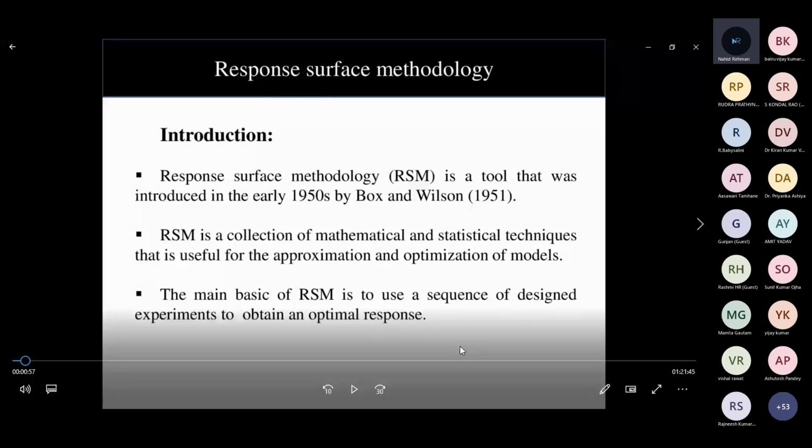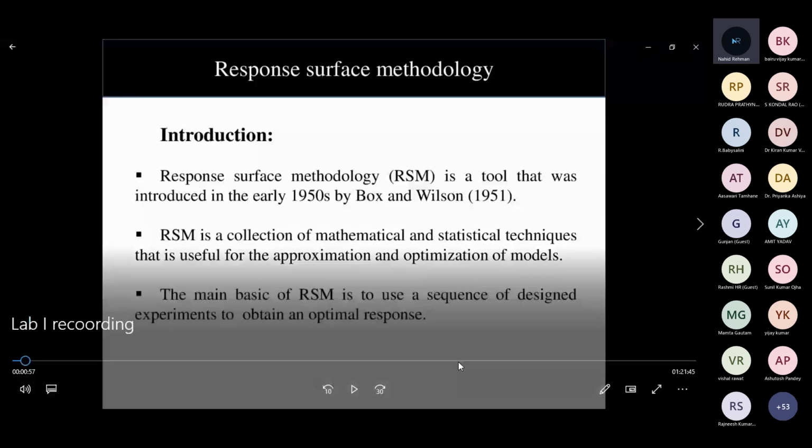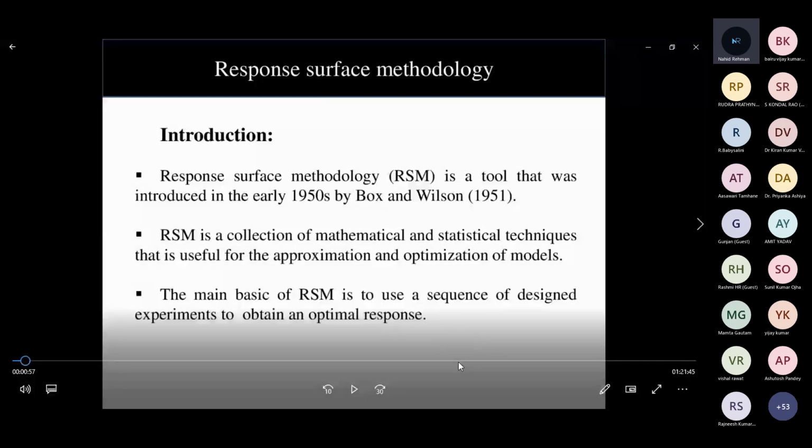Why? Because a slightly acidic pH favors the formation of formate and its further conversion into hydrogen, as well as the enzymes hydrogenase and formate lyase, which are responsible for hydrogen formation. They act optimally, meaning they have the best activity under acidic conditions, which may be pH 5 or 5.5 or even 6. So naturally you have to optimize that pH. Optimization means finding the specific pH point at which your microbe will efficiently liberate the hydrogen.